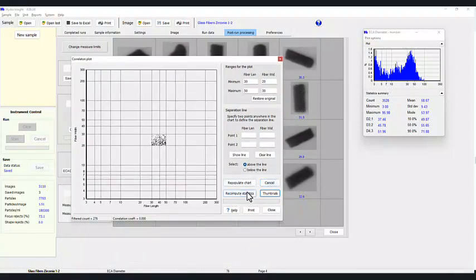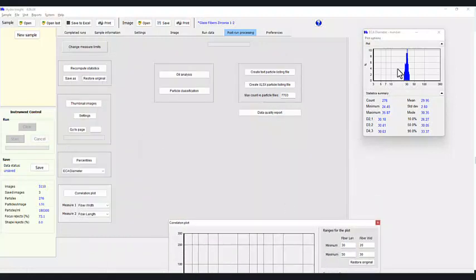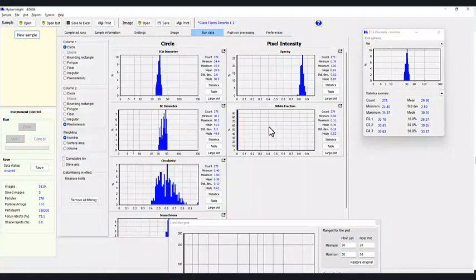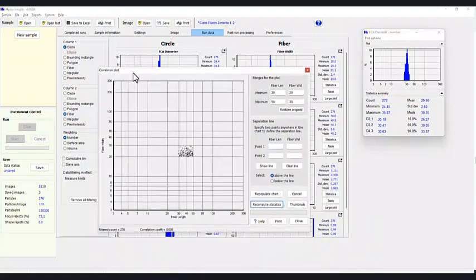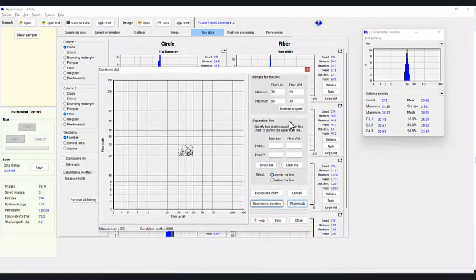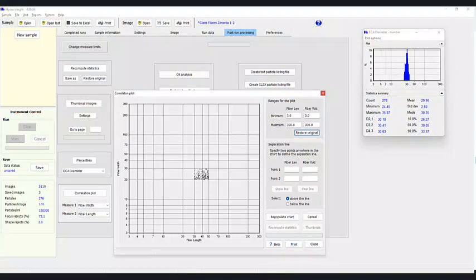The other thing we can do is look at the statistics. So, for example, for these particles in question, I wanted to see all the statistics just of those particles. Now, of those 276 particles in this little region, I can see all the statistics just of that: what the opacity was, what the size was, what the fiber curl was, width, length. And like I said, the thumbnails tend to be a good way of referencing back, giving you some validation as to what the particles actually are.